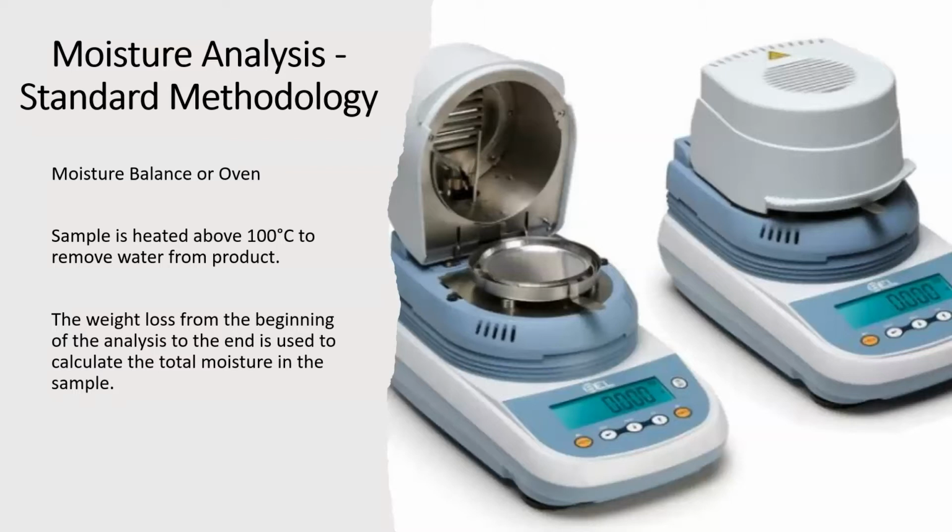Since the goal is to remove the water and water boils at 100 degrees Celsius, the sample must be heated to that temperature in order to remove the water that is present. Most methods suggest heating the sample up to 103 to 105 degrees Celsius. If a laboratory is using an oven, the time the sample will remain is determined by the total weight that is used, and laboratories should determine this time as a part of their method validation.